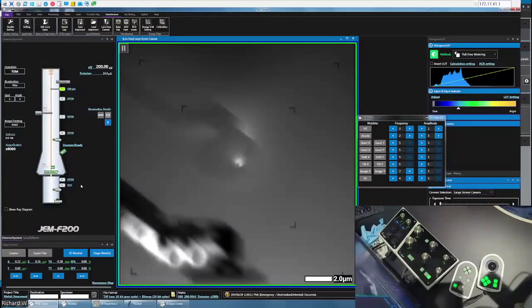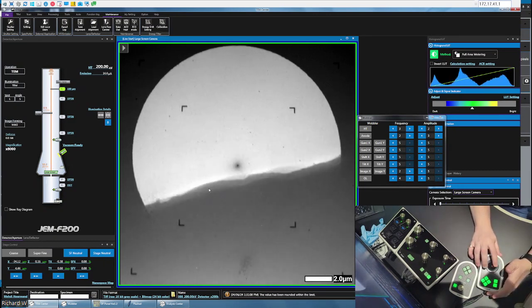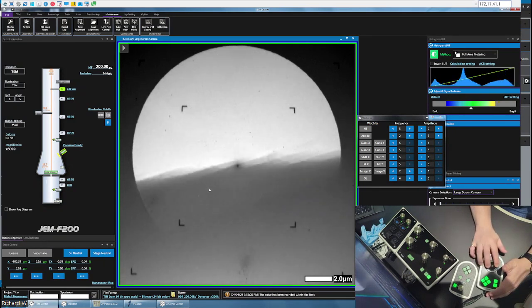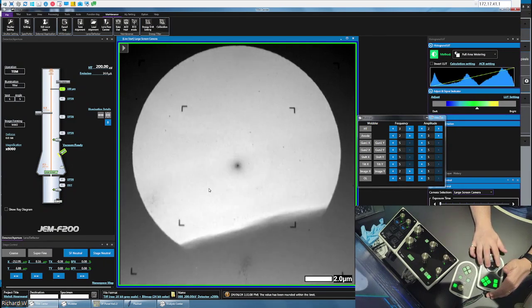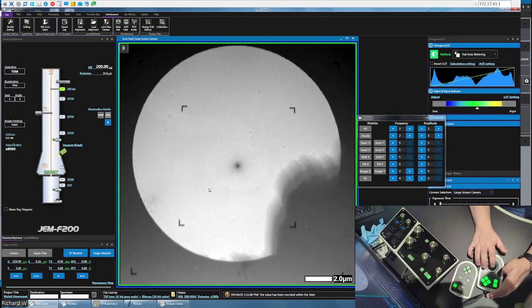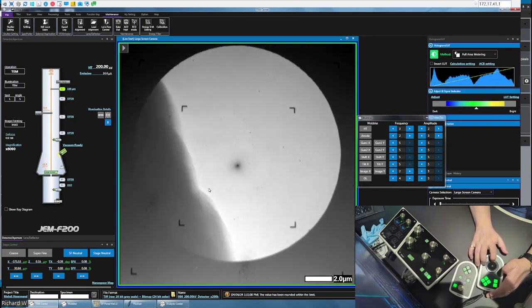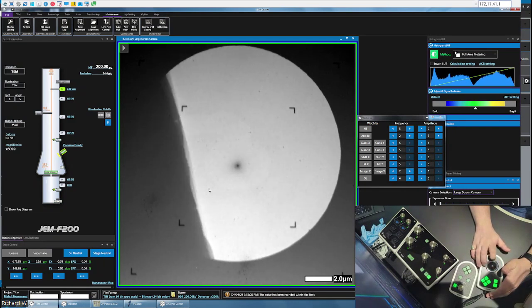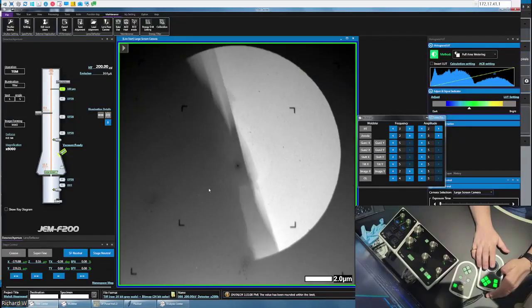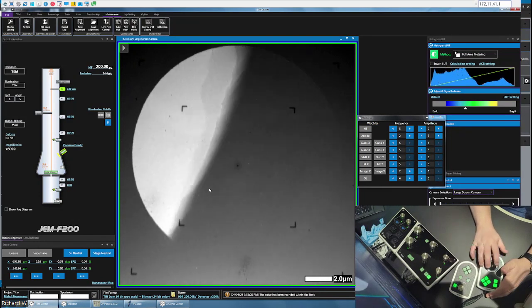So this is a FIB sample. I don't know if you're all familiar with FIB samples, but they're slightly different to your regular TEM sample in that they're on a different shaped stub. Okay, so that's promising. So what we're following is the grid along, and then we should see in a short while the sample sticking out the side, I hope.